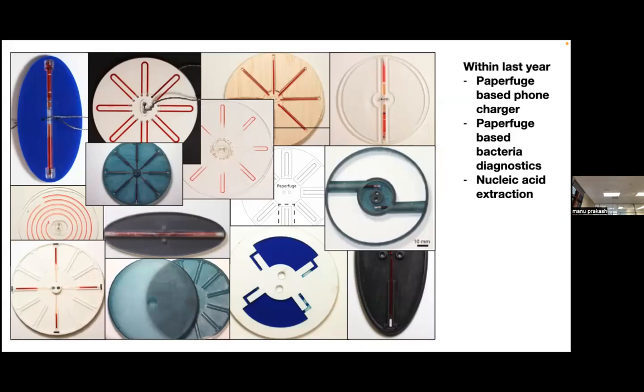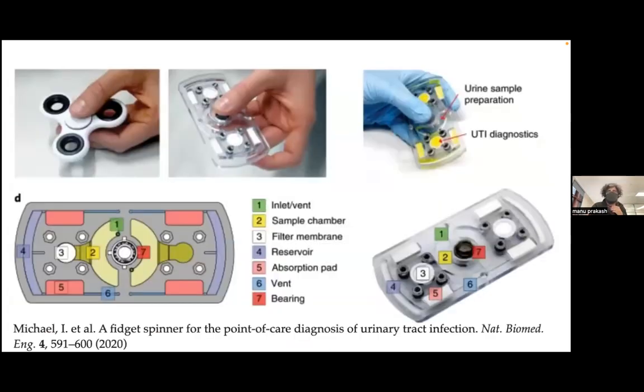The discs are much larger. You can see all kinds of materials. You can see those U channels, and think a little bit about, I don't know if you guys see this, that's a spiral. There's a really interesting phenomenon that happens when you take centrifugation in spiraling channels, because at every point you can get a very long capillary. And then again, every one of these can be in a disposable format. So lots of fun things have been happening.